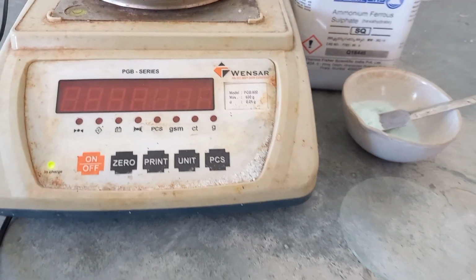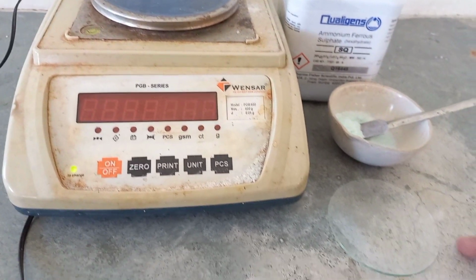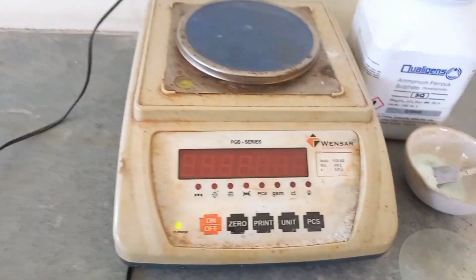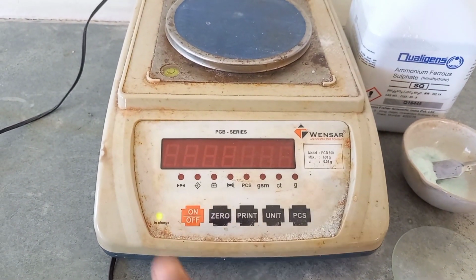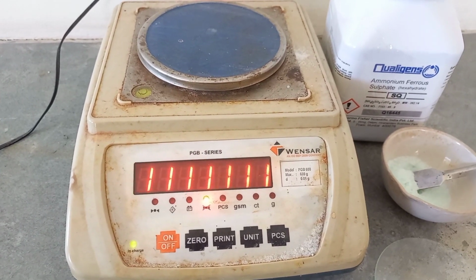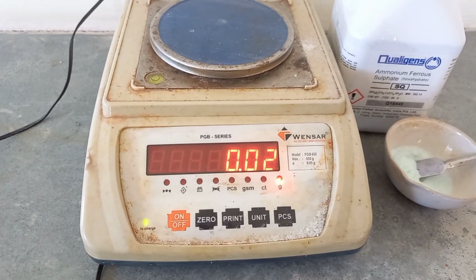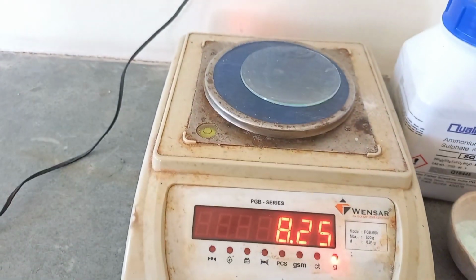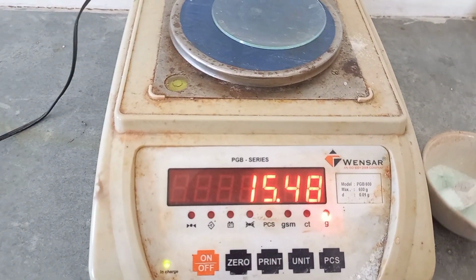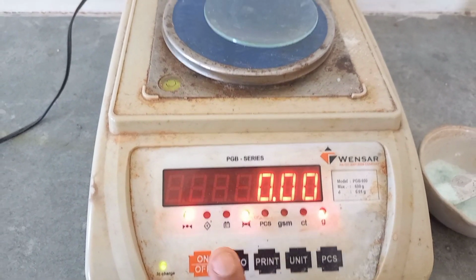Here students, we have this weighing balance. Electronic weighing balance is available in all the schools, in all the laboratories, and I took one watch glass. Here is the ammonium ferrous sulfate, that is Mohr's salt. I took out this Mohr's salt in a china dish, and here is the balance. First of all you press the on or off button. As soon as 0.00 comes, or wait for some time, then place your watch glass there, note down the value of the watch glass, and then make it 0.